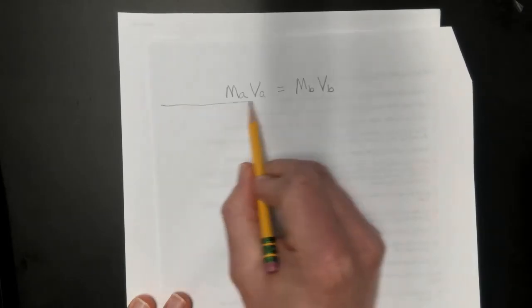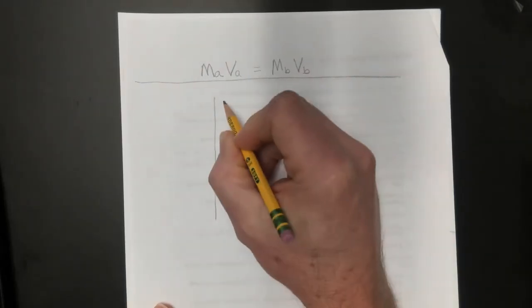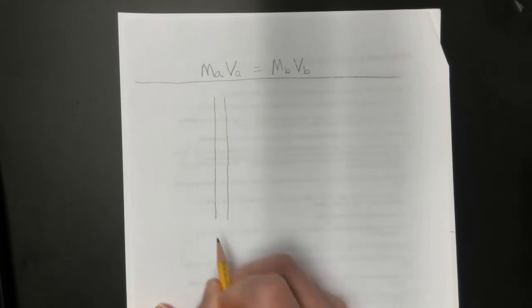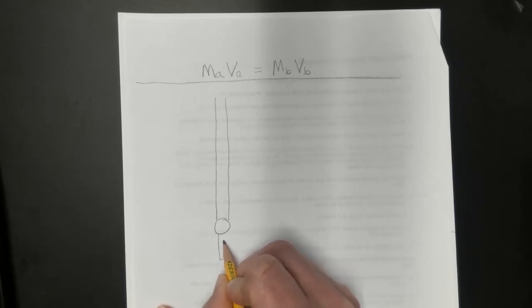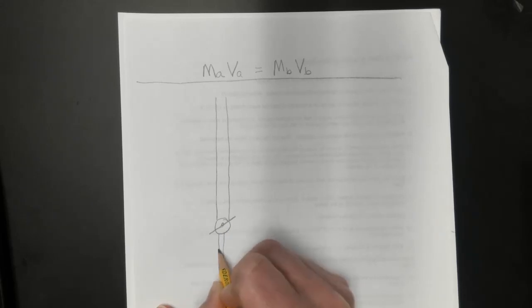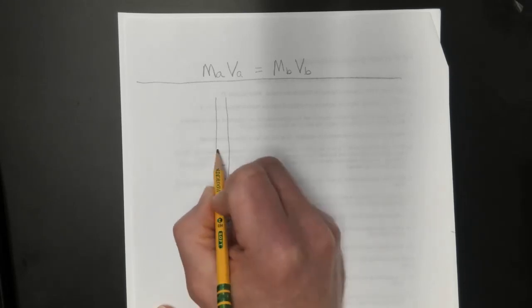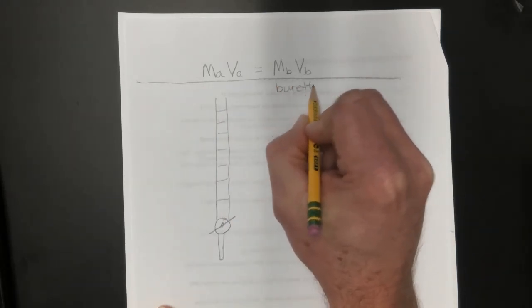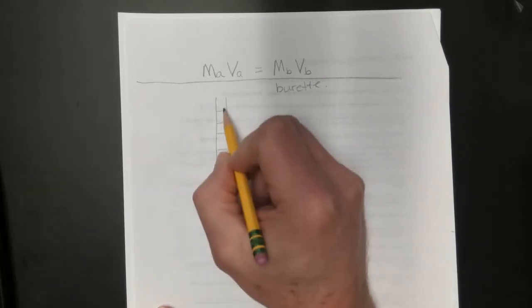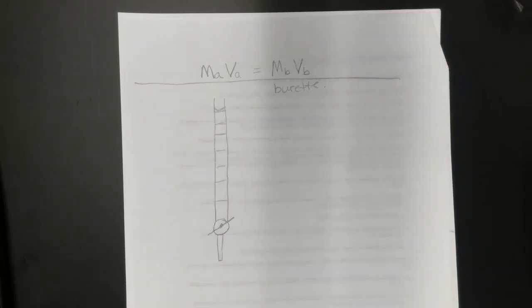So, details of the experiment. Titration. What you're going to have is a burette. A burette is a long, skinny glass tube, like so. And down here at the bottom, you have a spigot, and you have a little knob right here. And there are graduations on the burette. Again, this is called a burette. So let's say the meniscus is right here, and in this experiment, the burette will be filled with the sodium hydroxide solution, in both cases.